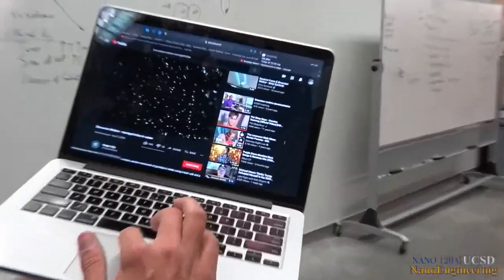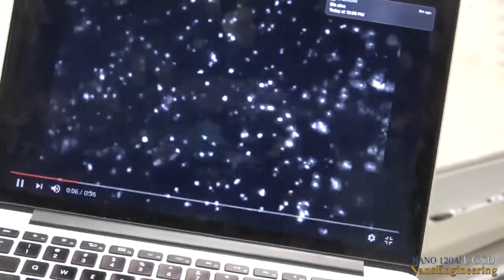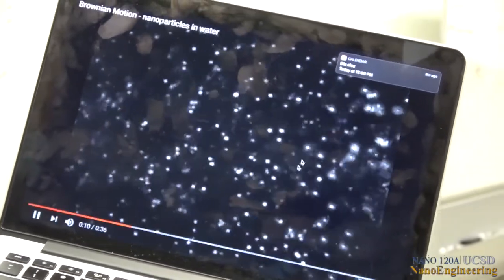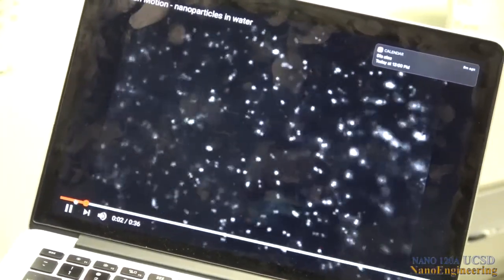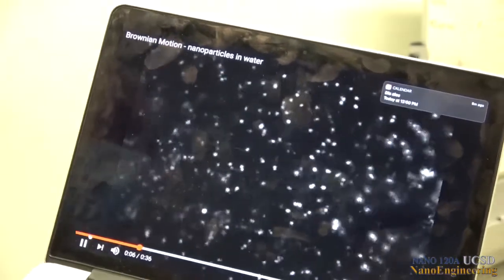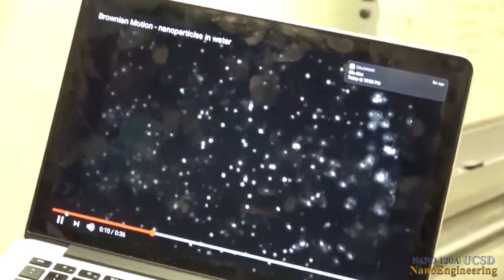So this is a dark field microscope, and hopefully these are just silver nanoparticles that are moving underneath a dark field microscope. Isn't that amazing? I mean, this is what these particles look like. The instrument that we're using today, dynamic light scattering, does not do this, right?